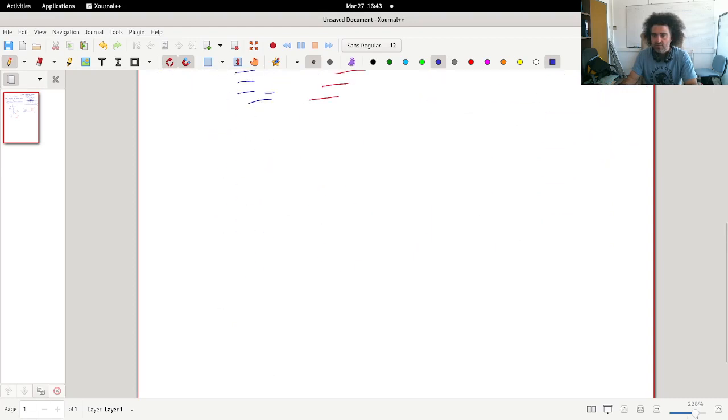And the first step, step number 1, is to identify the so-called interesting regions. So these are not yet the regions with the peaks, but among them we might find several regions that correspond actually to peaks.